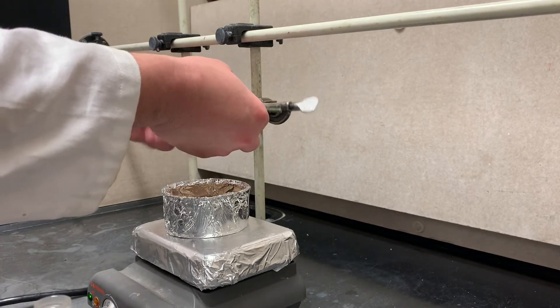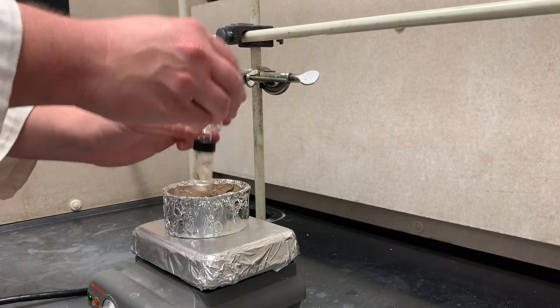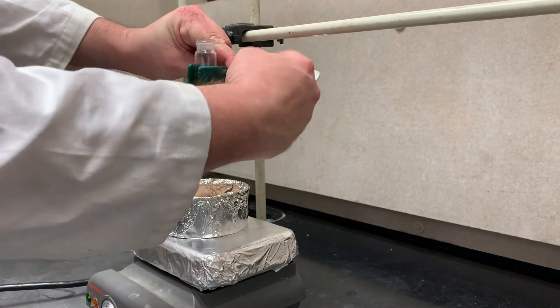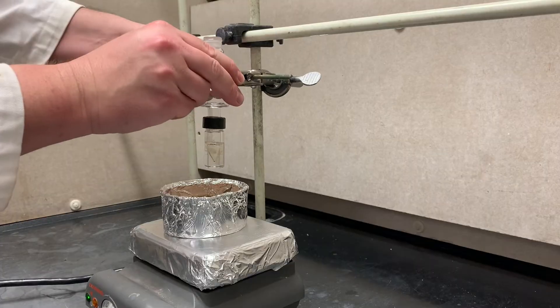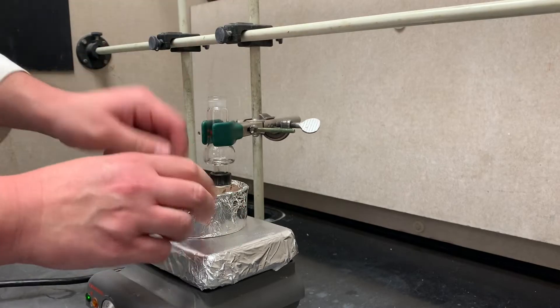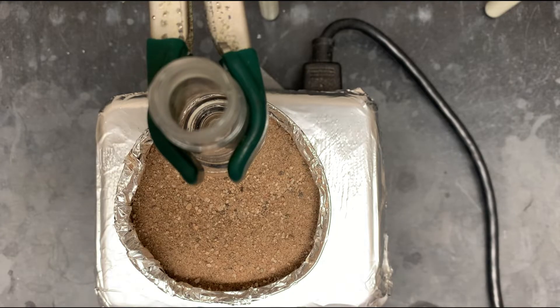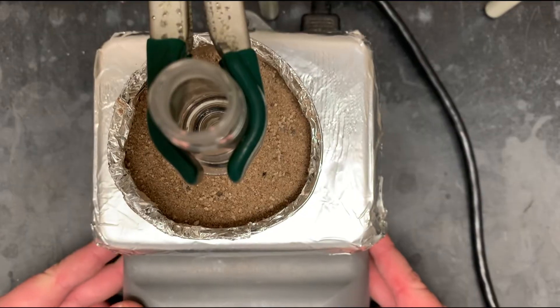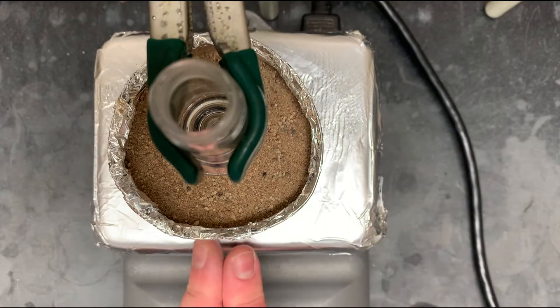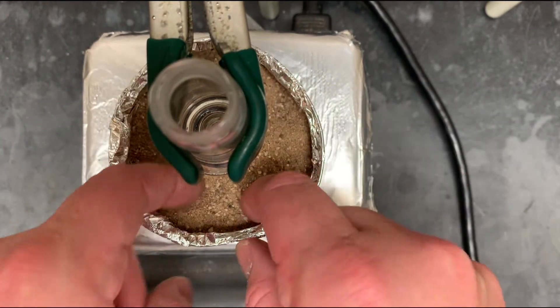You'll need three clamps today: start with two large and one small. It's always best to start the clamps a little too high, lock them into place first, and then make adjustments. Center the vial in the middle of the hot plate — both forward/backward and left/right — so the spin vane stirs properly. If you don't have enough sand, add a little more. Lower the assembly into the sand and vibrate it gently so it sits smoothly.